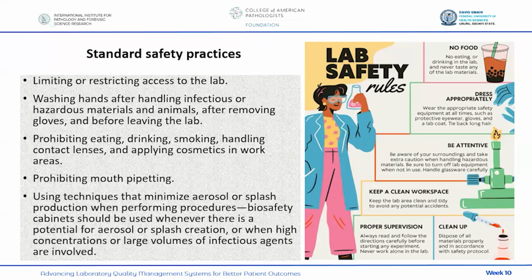Okay, on this other side, you can see these are signs for no food. Dress appropriately, wear appropriate equipment at all times. Wear your protective eyewear, gloves, and a lab coat. Tie back long hair.